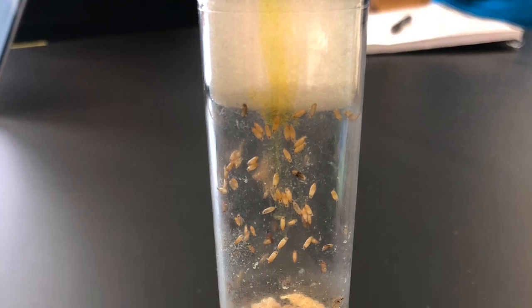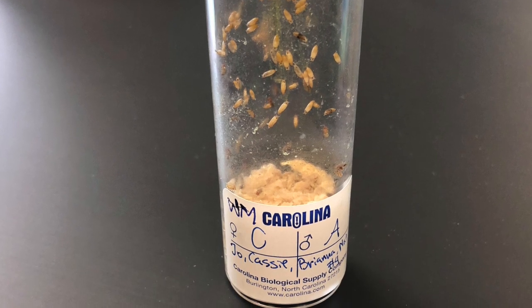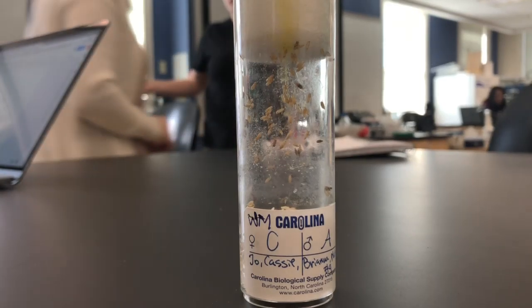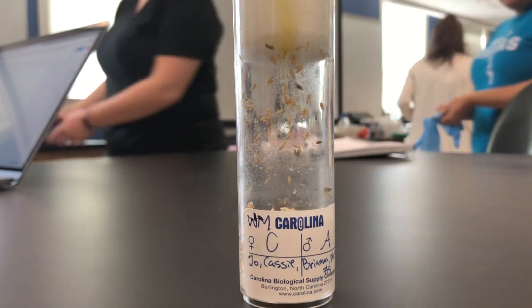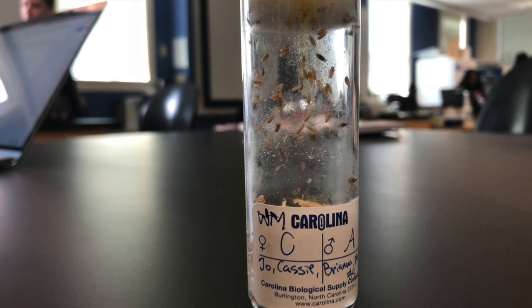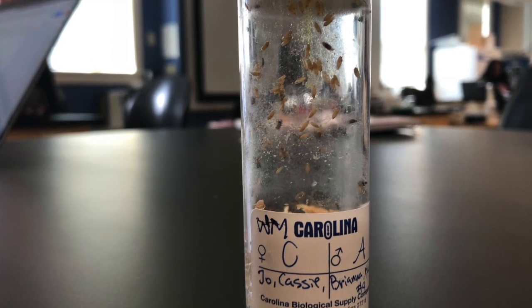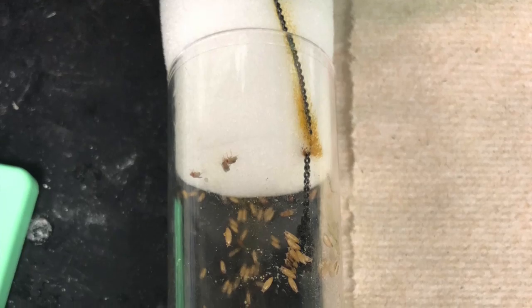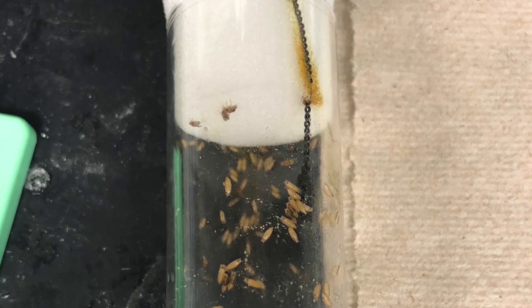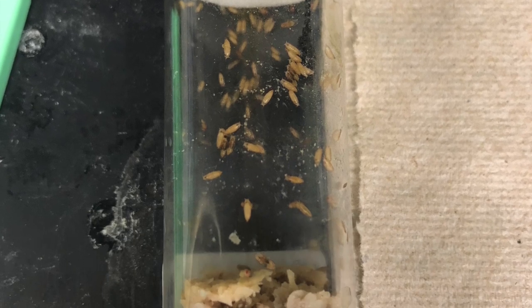After 7 days, larvae could be seen growing on the walls of the test tube, as well as grown flies jumping inside. In order to efficiently observe those flies, fly nap was used. Using a small brush, it was dipped into the fly nap and placed in the test tube gently while it was on its side and left to rest for 5 minutes. After the 5 minutes, the flies were asleep and ready to be extracted from the test tube.